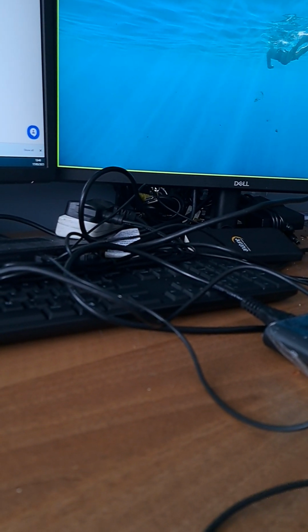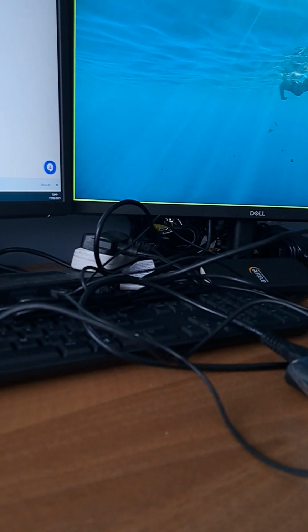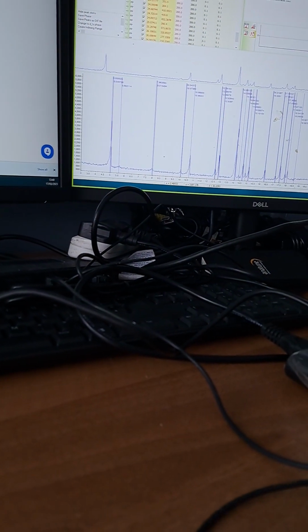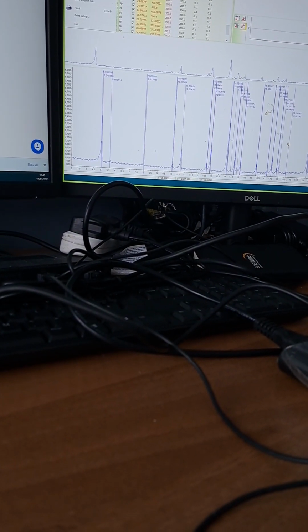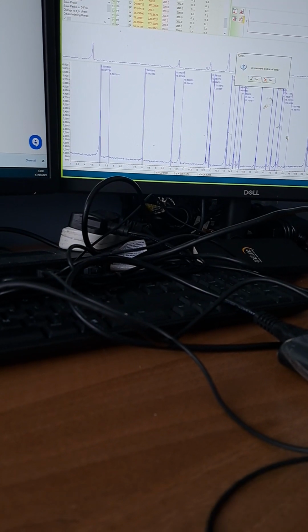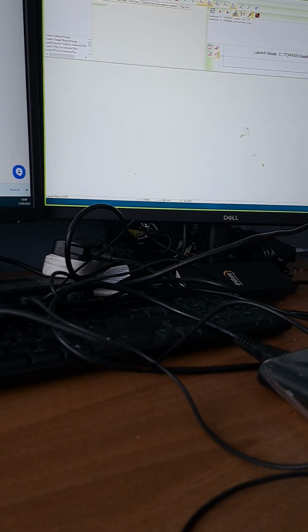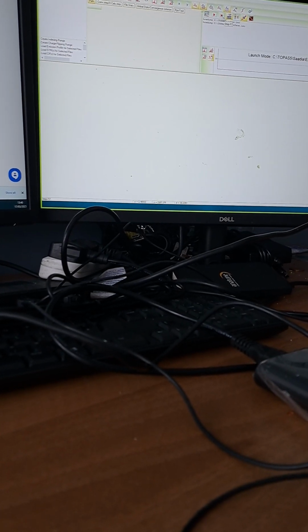So if you go to Topaz then, you'll want to go to File and Close All. Close all? Okay. Yes. And now then, if you go, yeah, that's it. And press go.